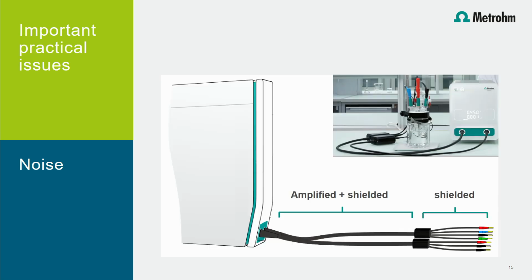One clever technical solution to reduce noise pickup is to amplify the measured signal in the vicinity of the sample. This is done by an external electrometer, which is located very close to the sample. From this place, the noise pickup is reduced to a minimum.